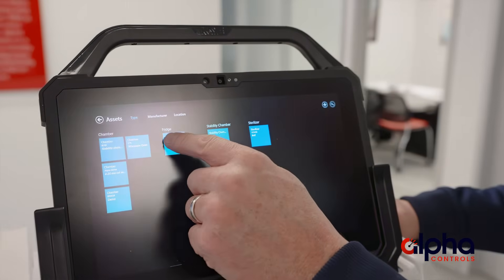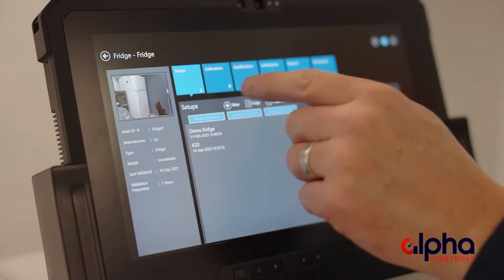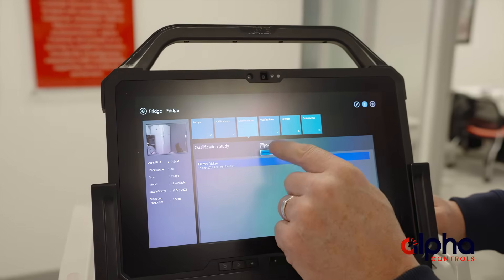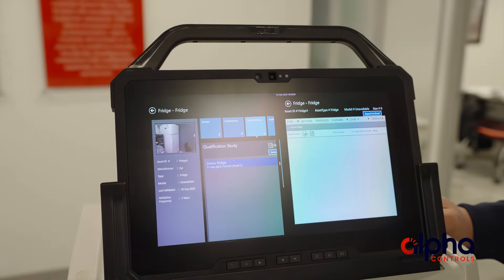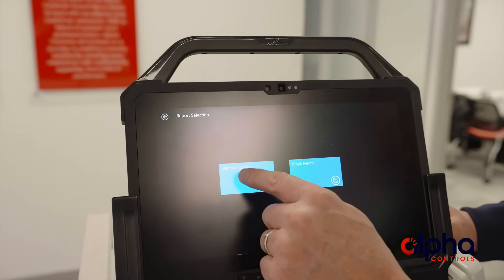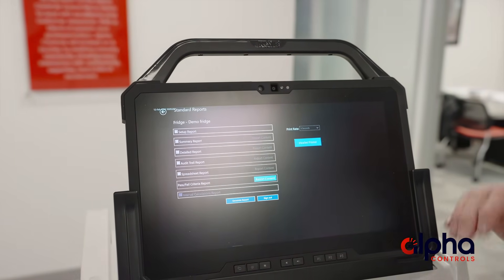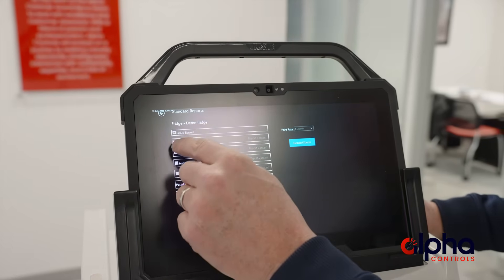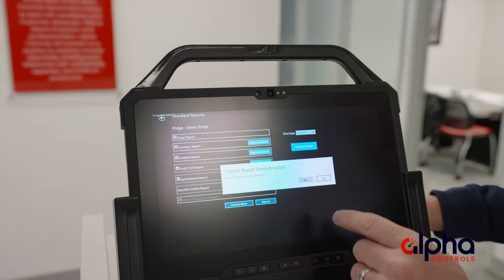I've already created one here called 'fridge' and I've already run the study as well. Now what I'm going to do is look at the qualifications tile, highlight that, and generate reports. We'll hit temperature and then hit standard report. One thing I didn't mention is that with version 2.0, you have the ability to select all the reports and generate them all at the same time, saving you a lot of time.